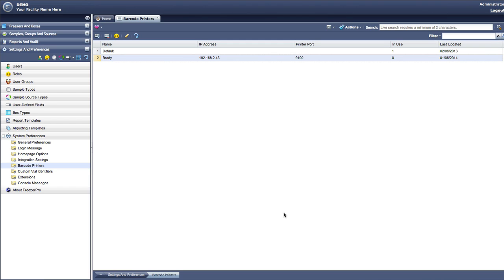This concludes the General Configuration Managing Barcode Printers video tutorial. Up next, we will discuss managing user preferences.